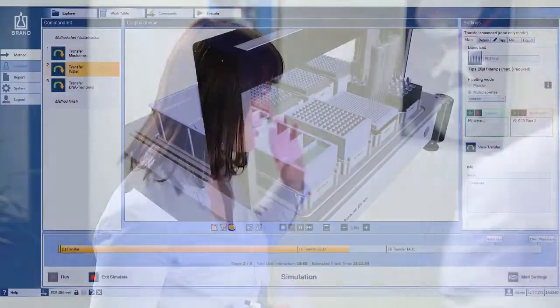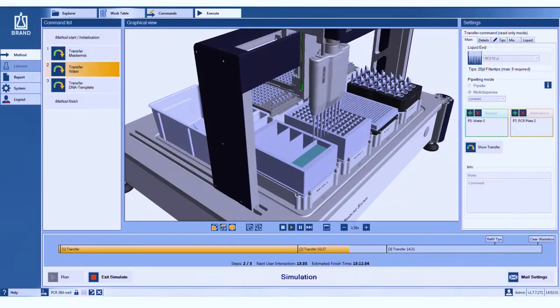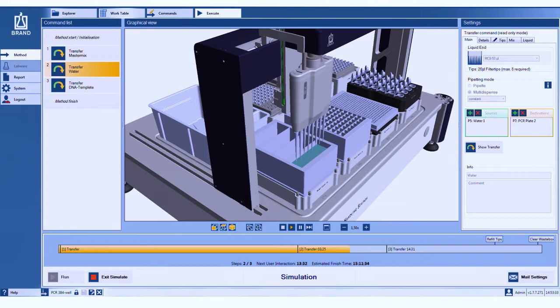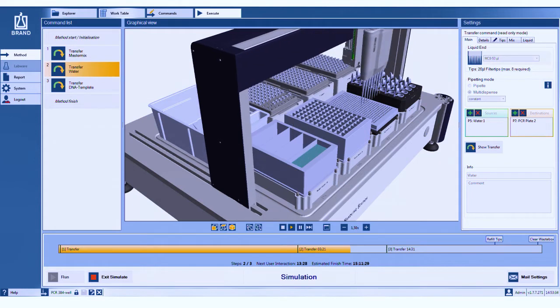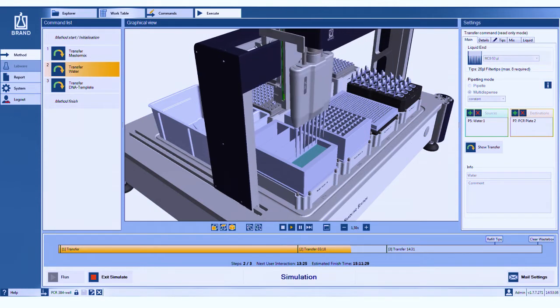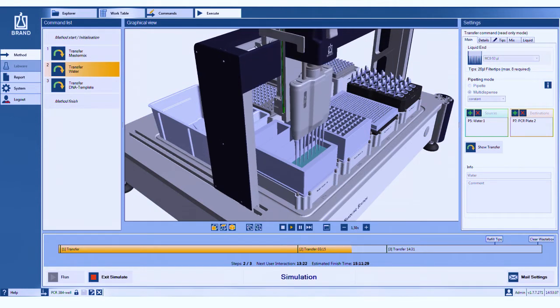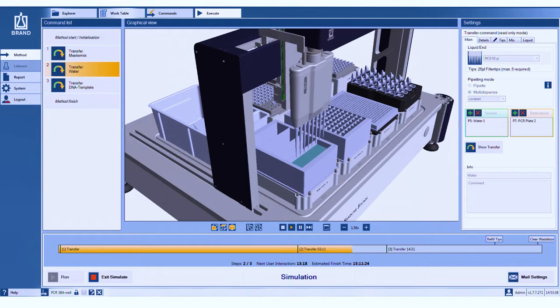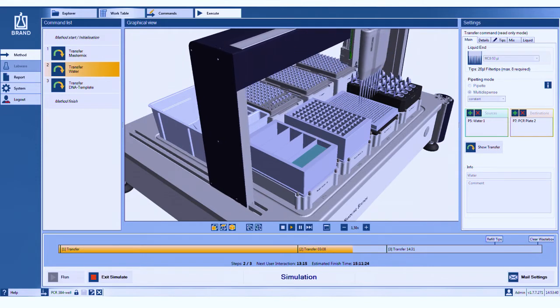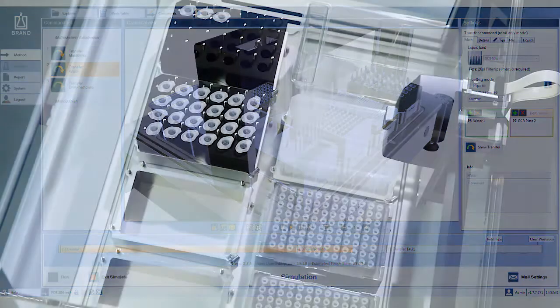The simulation function of the Brandt software also saves time. It avoids endless trial and error. Test your method before the first execution and detect necessary improvements.